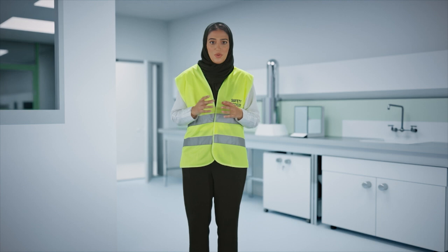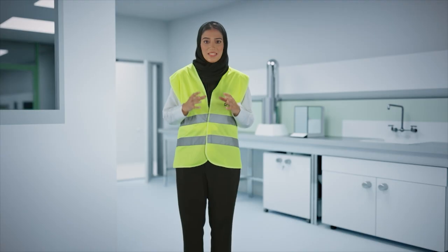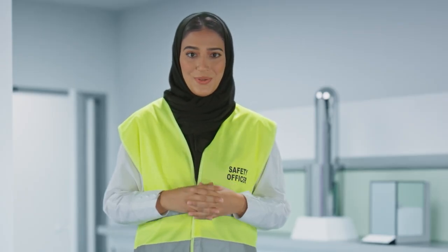You must decide whether you should fight the fire or flee to safety, but always follow the directions of your instructor. If you decide to try to put out the fire, you will want to be confident that your actions will not spread the fire or put yourself or others in more danger. The best method of extinguishing a small laboratory fire is to smother it. Consider taking the following steps only if you are confident that you can do so.